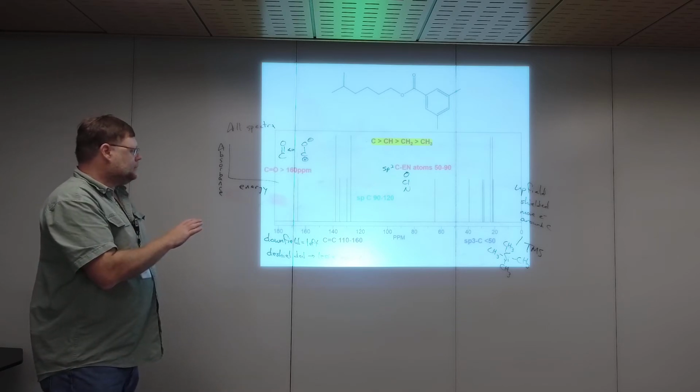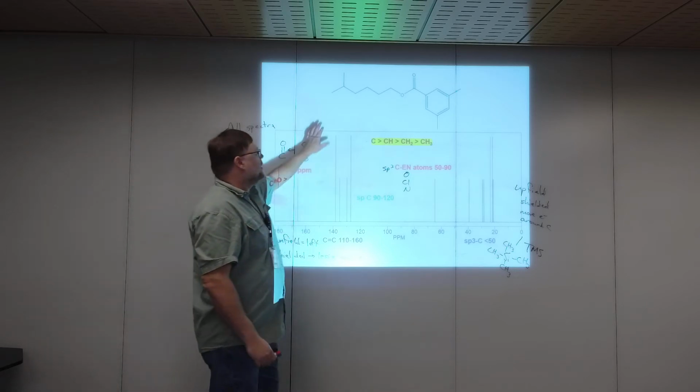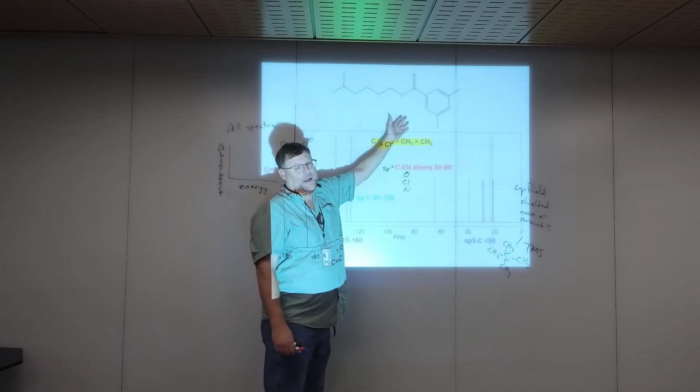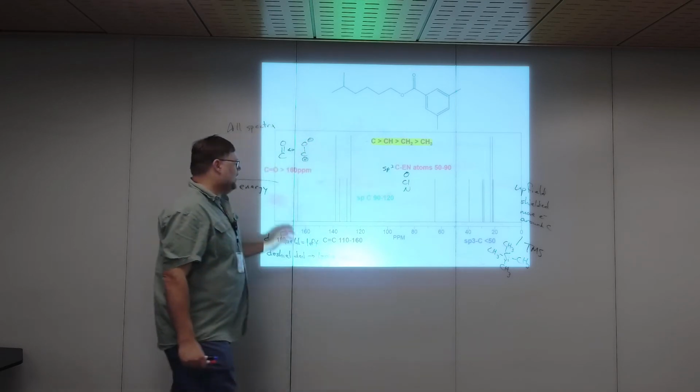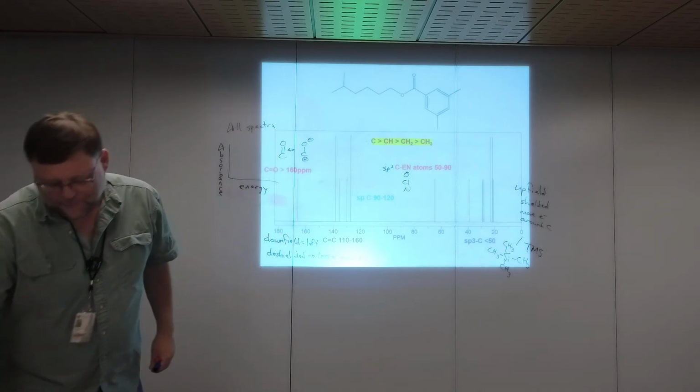Okay, so now I want you to hit pause. Count up the molecular formula of this molecule. This comes out of the line structure stuff we've been doing. And then count how many peaks you have in your C13 NMR. So hit pause and do that.